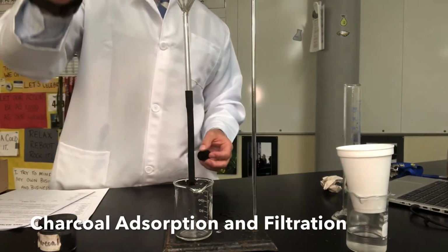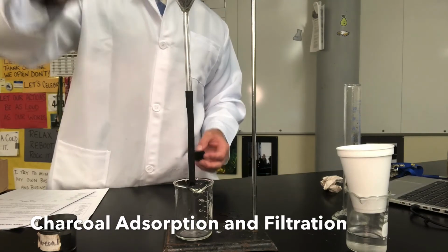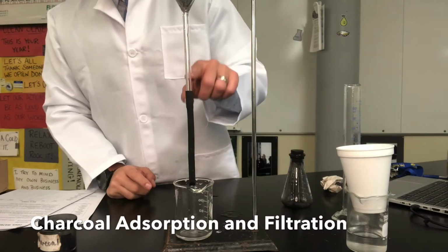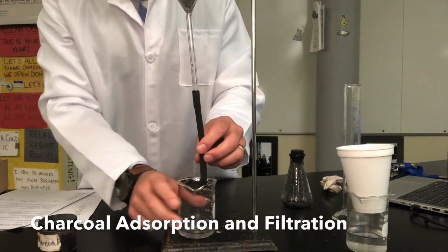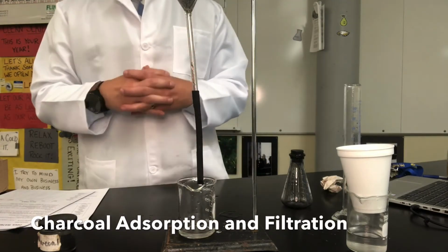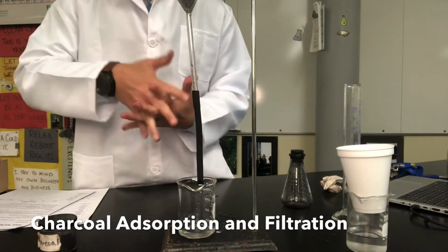So I'm gonna pour this into the filter paper, and it's coming out thick black, but let's see what comes out towards the bottom. Awesome. If you can see, the water's already trickling down, and it's probably hard for you to see because it's clear. That's right. Our water is coming out crystal clear. The charcoal did a great job of sticking to the impurities, and gravity's pulling the water down, but the filter paper won't let the charcoal through.